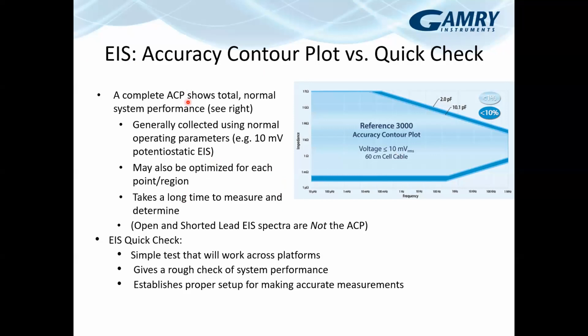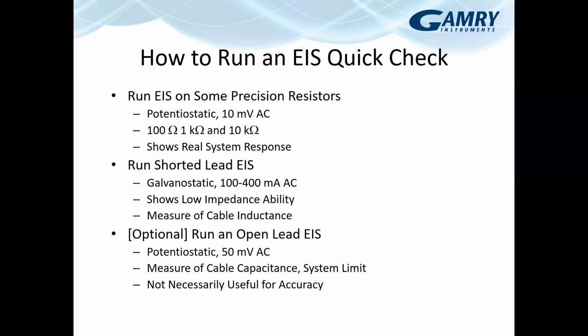EIS Quick Check. So this is what we run. We determine this, and it's kind of cumbersome. What you would rather do for yourself, if you're trying to do these comparisons, is this EIS Quick Check. That's just a simple test. It works across different systems, different platforms, however you have your setup, and it gives you a rough idea of what your system performance is. It also helps to establish proper setup for making accurate measurements.